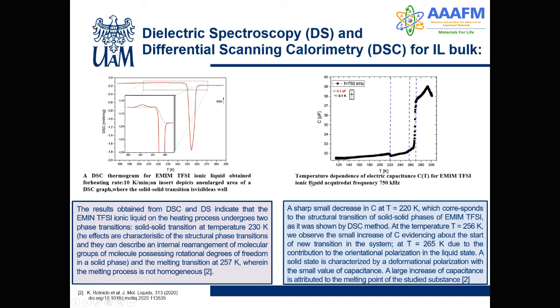The same results we can see from a measurement of dielectric capacity versus temperature. We can see a change of capacity at the temperature typical for the solid-solid phase transition, and a big change of the capacity typical for the melting behavior, as the dielectric orientational polarization of the molecules does not exist in the solid state. So we can see a big increase of the capacity at the melting point.